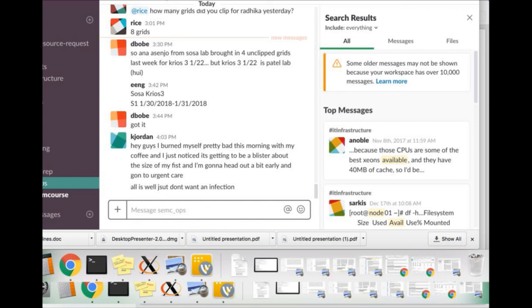All this to say that the question is more about processing. If you process it well, then it's not an issue. It's much more common to combine data sets from the same microscope, like one day, even from different grids that you stick inside. That's pretty common. You process a data set and say, oh, it's not quite the resolution I want, I need more angles, I need more data. So you make a grid, stick it in the same microscope. That's pretty common for a lot of reasons.